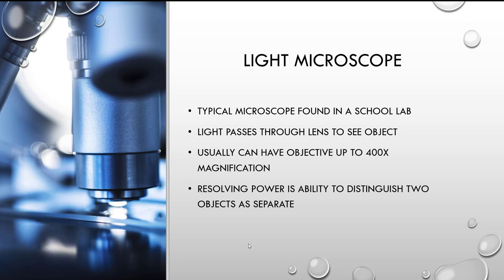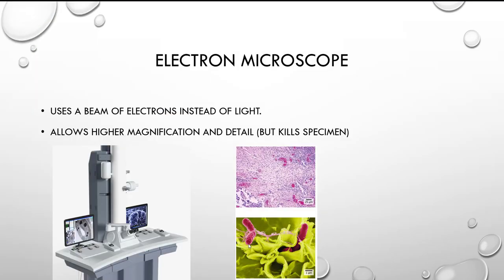So the light microscope, definitely fun. Unfortunately, we don't get to use these in the online setting, but you will get to see some images in our workbook. Now the electron microscope is different. I've actually never used one. They're very expensive. When I was doing my master's degree at Cal State Fullerton, they had one deep in the basement somewhere, and I wasn't even allowed to go in there.